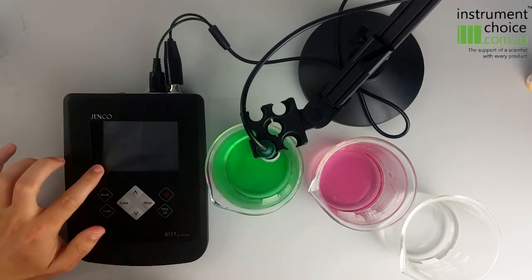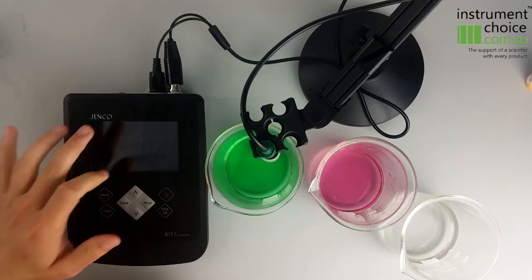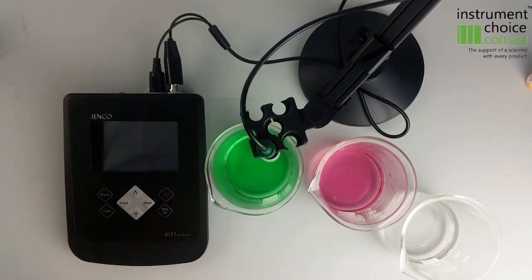That'll then take us into our calibration mode. As you can see, 7 is flashing up there and it's got a white symbol which is letting us know that it's currently calibrating to 7. It'll give us a lock sign when it's done.